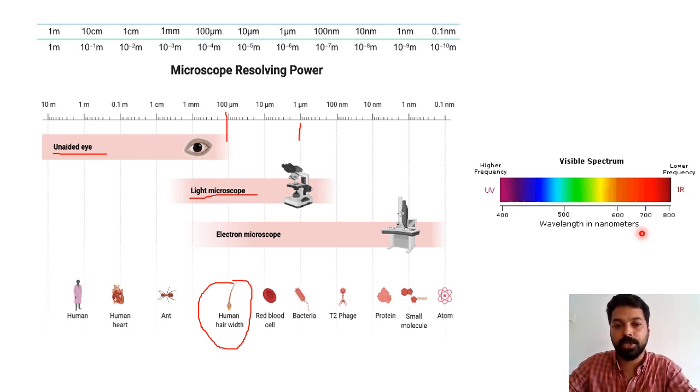For that, the scientific world has employed the electron microscope, because its wavelength is much smaller than the nanometer range. So we can use an electron microscope, and you can visualize particles nearly in the angstrom range. You can see particles less than 1 nanometer also. By using the electron microscope, we can visualize up to 1 nanometer or less.